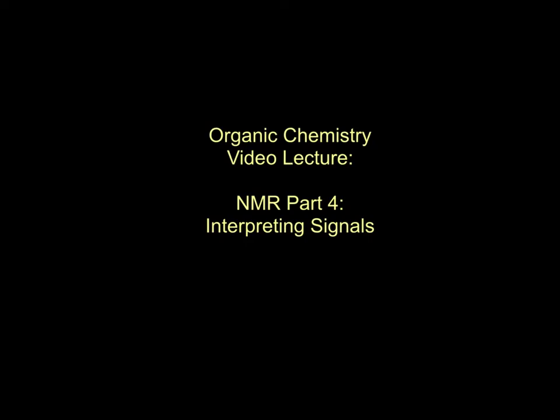Greetings and welcome back. Today we're going to be tying everything together that we've done with NMR and talking about how we interpret a signal. The whole point of these methods of spectroscopy is not to figure out what a spectrum looks like, but to be given a spectrum and say, what does all of this mean?